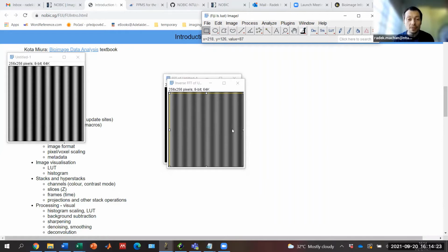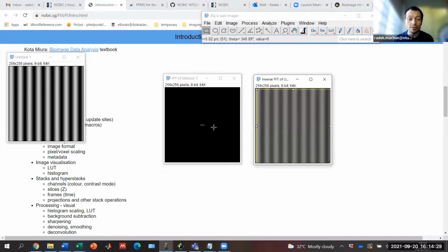An alternative way how you can look at it is using Fourier transforms. And you may say that what the aperture, the numerical aperture of the microscope is doing, it's basically causing a cutoff in the frequency domain. So it is doing the same thing that we saw here, that we are losing some of the higher frequencies. And that's why you could see that this is also causing blurring of the images, and also a loss of contrast for high frequencies.